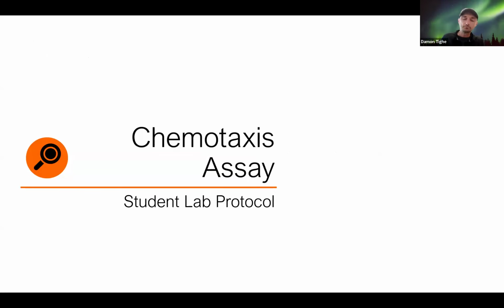So the workflow today is we're actually going to get started right away with doing a lab protocol, which is unusual. Usually it's good to dive into the theory first so you know what you're doing. But the reason we're going to start with a lab protocol today is because the chemotaxis that you're going to be performing takes about 30 minutes for the worms to decide where they're going so that we can analyze the results. And so we need to just get that started so that it can happen in the background, and then we'll step back and do a bunch of the theory while those worms are moving their way around their plate and deciding where to go based upon their ability to learn or not learn.